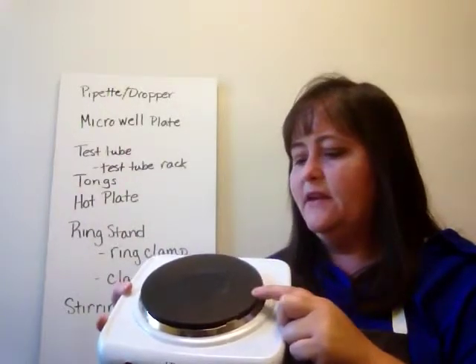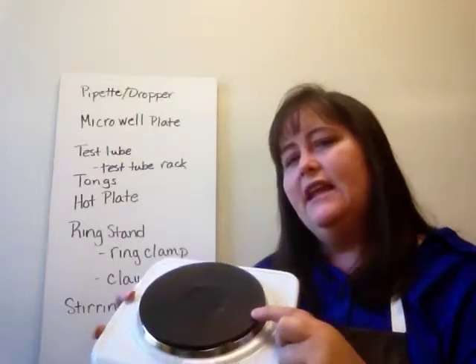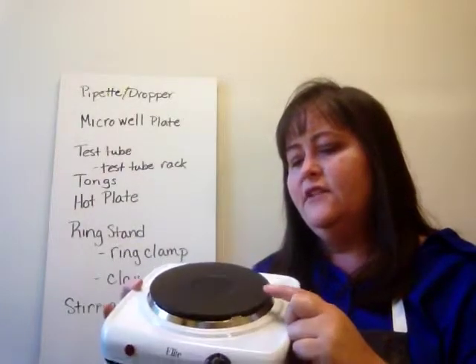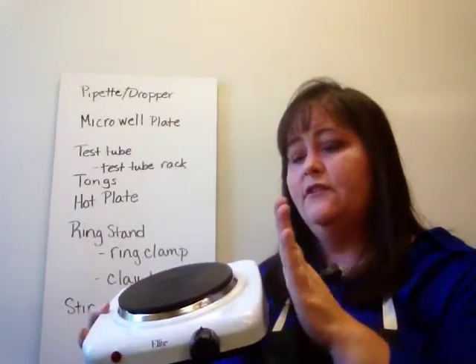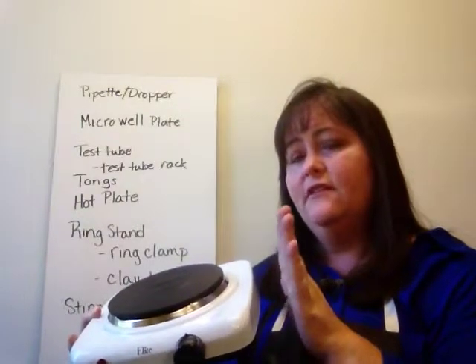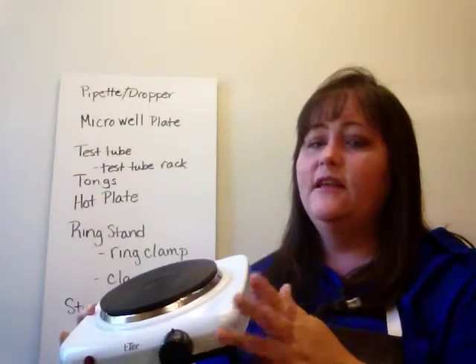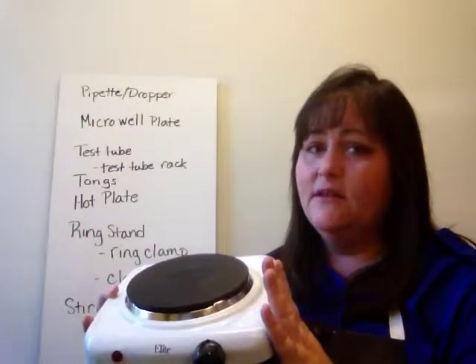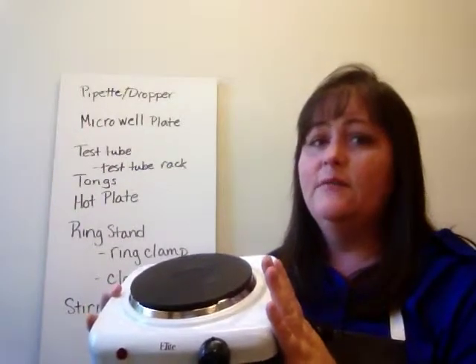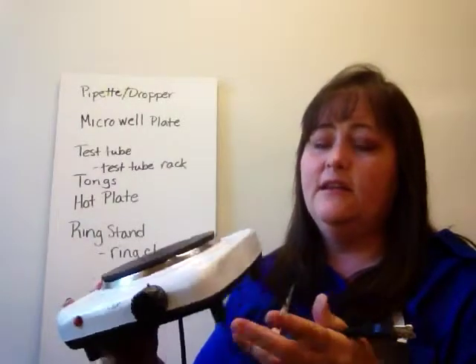You can't tell because it's coated with this, I think it's a ceramic coating, and it keeps you from seeing that it's hot. So you got to make sure that it's been off for a while, and you've got to make sure that you just put your hand close to the hot plate so that you can tell if it's hot or not. If it's too hot, you've got to wait for a while before you touch it. In fact, we'll probably leave these off and unplugged when we're finished using them for a complete day before we put them away, just to be sure that we're not going to get burned.